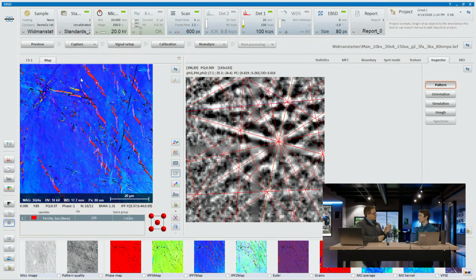Yeah, exactly. But what we're seeing now is direct data taken from the sensor. You're sending electrons in, and it's electrons out that we detect. Just like a solar panel with light, but now this is with electrons. An electron comes in, hits the silicon, creates energy, that's directly detected. And that's what we're seeing here, this pattern. So it's directly detected, and that's the secret to the speed. That's right, yes. That's the key to the speed, and that's also why we can do this now. We couldn't do it 10 years ago, because we didn't have that technology. So that's pretty cool. So what it does is it'll capture these images, and then it identifies the lines, right? Yep.